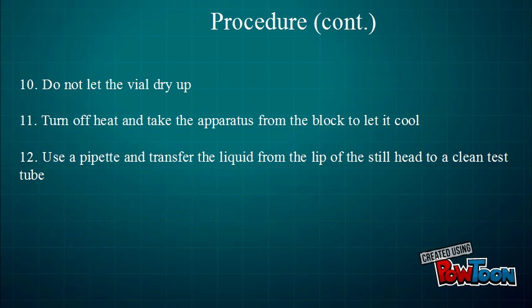Do not let the vial dry up, as this could break it. Turn off the heat and take the apparatus from the block to let it cool down. Use a pipette and transfer the liquid from the lip of the still head to a clean test tube.